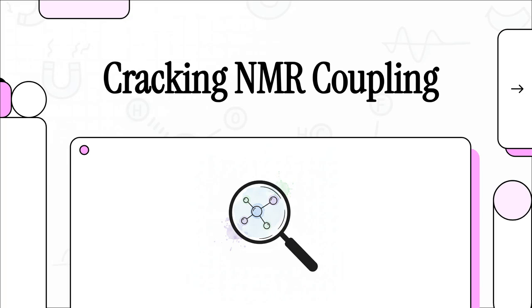Welcome to today's explainer. If you've ever really stared at an NMR spectrum, you already know that spectroscopy is, at its core, molecular detective work. It's about finding the clues. And today, we are going to learn how to read some incredibly specific structural fingerprints. We're talking about the traces left behind by heteronuclear coupling in carbon-13 NMR.